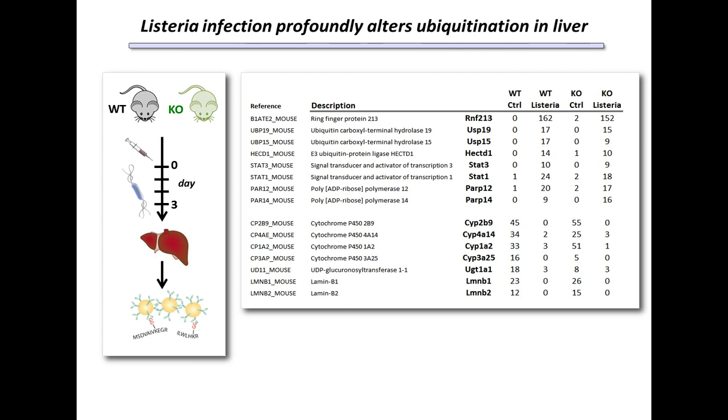Now, ubiquitination is going on in the basal state in cells all the time, and there are many important targets that are being ubiquitinated as a part of normal function. Proteins in the liver, such as cytochrome P450s, and you can see strikingly in the lower half of the table how certain proteins, such as the P450s and others, have their basal ubiquitination effectively turned off in response to infection, in ways that are quite interesting with respect to drug development and the role that P450s often have in modulating small molecule inhibitors.